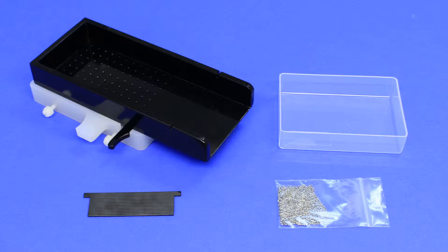BMP Scientific Series of Drop Dispensers allows you to fill your microplate with stir elements quickly and easily.